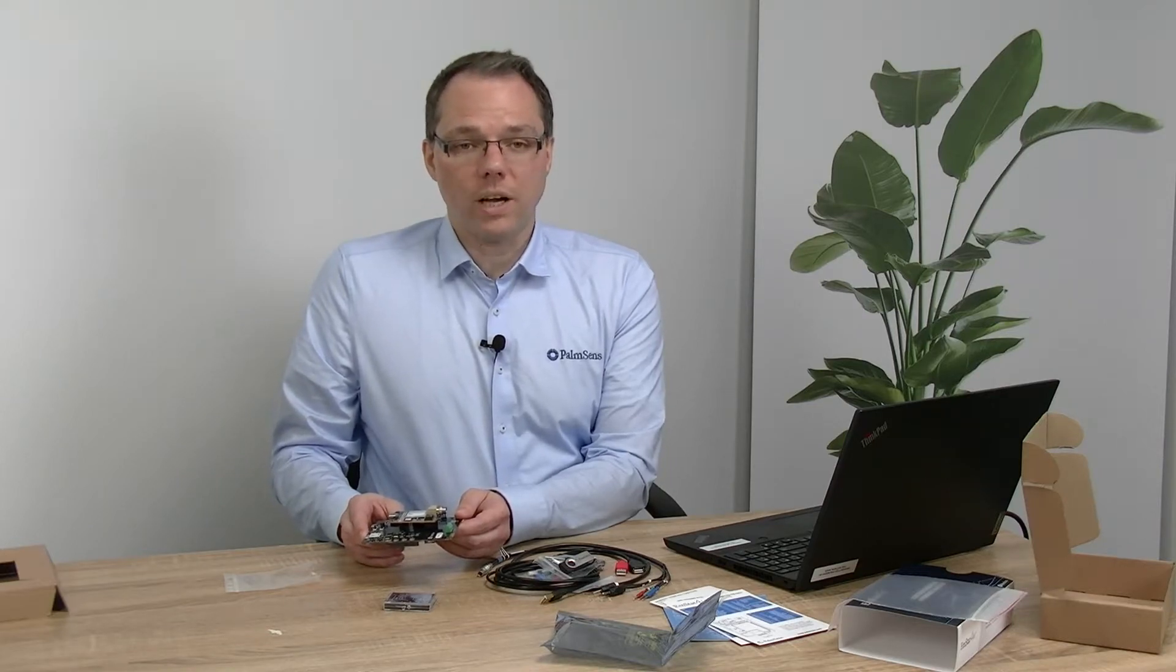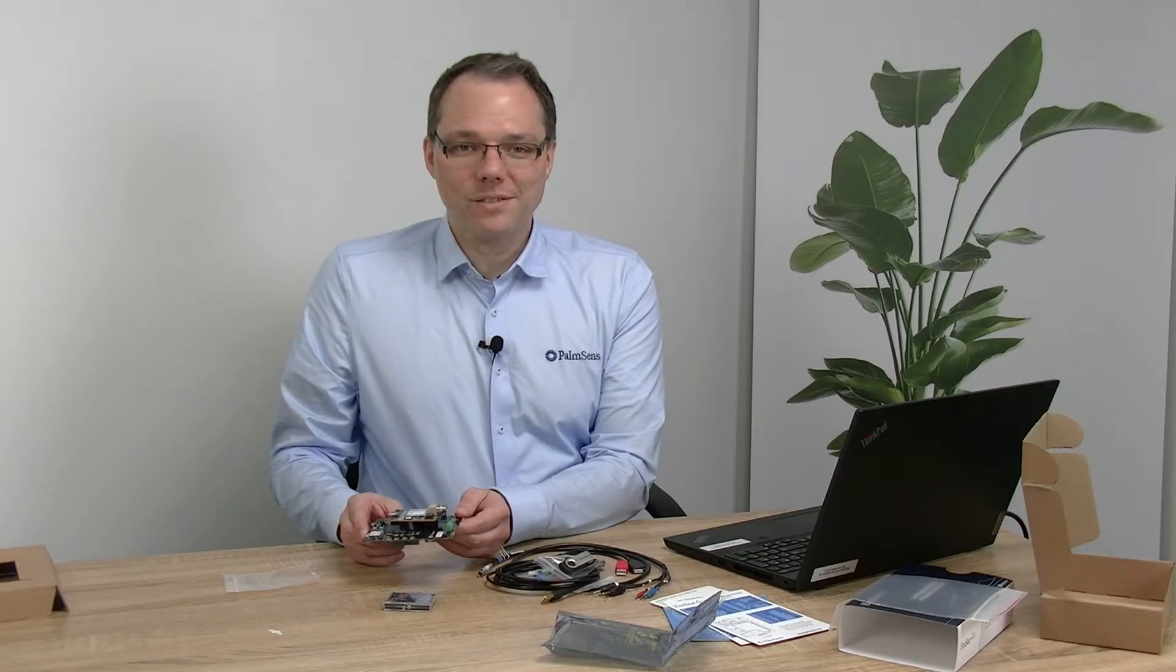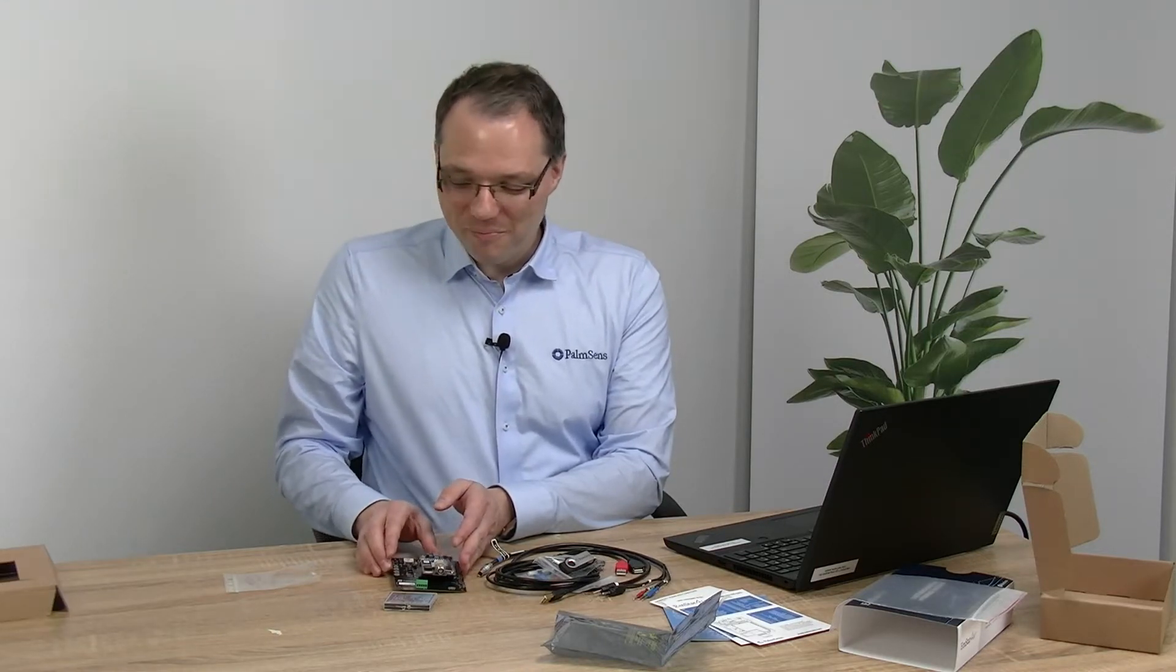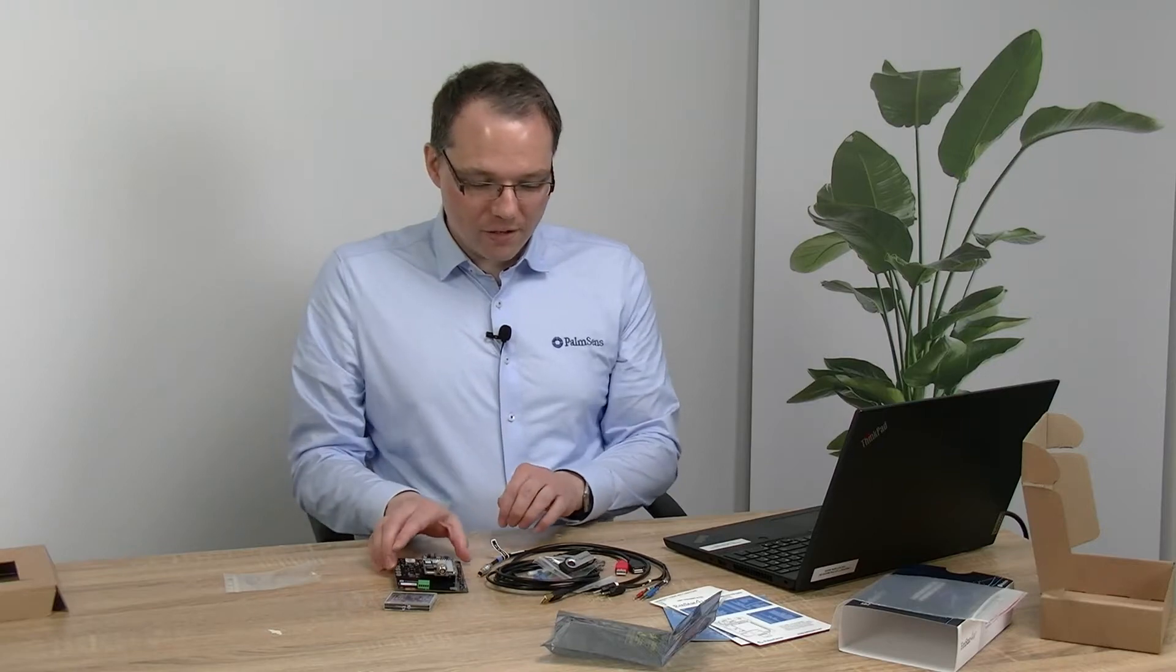Yes, so you can easily connect these. Due to the fact that this potentiostat module works with our scripting language MethodSCRIPT, you can easily also write software for the Arduino that then controls the potentiostat. So this is what you find in the box and I would like to make your first measurement together with you right now.